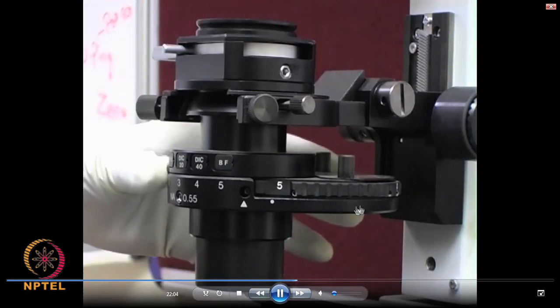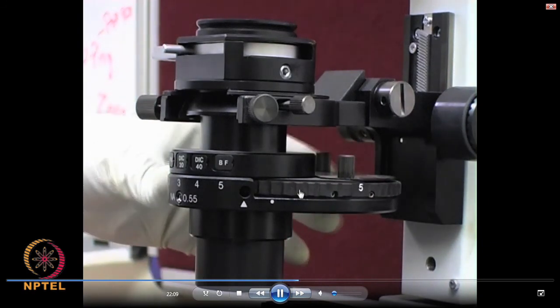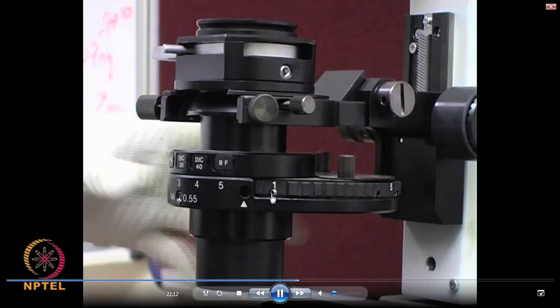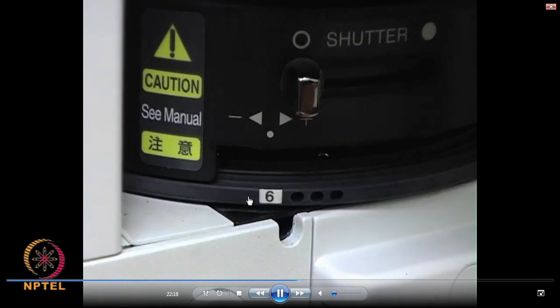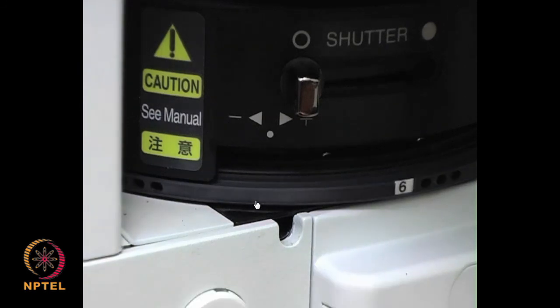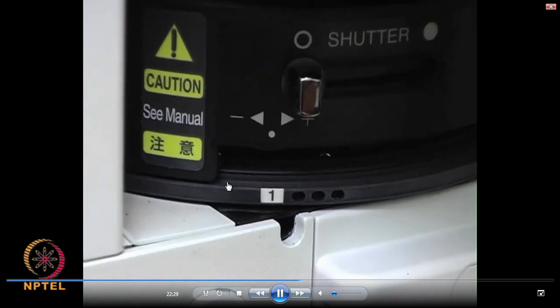When you rotate this condenser apertures and filters, this particular aperture will have the phase plate, and the phase plate will be inside. Similarly, here also you will have the phase plate. Whatever we have seen as a phase plate will be kept inside this along with this condenser apertures and filters. So, now look at the images and also see the enhancement in the contrast. We are trying to focus the image still.